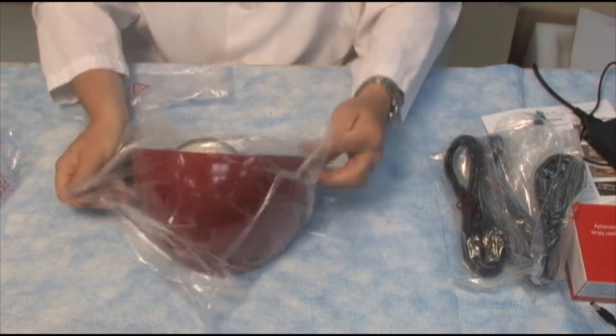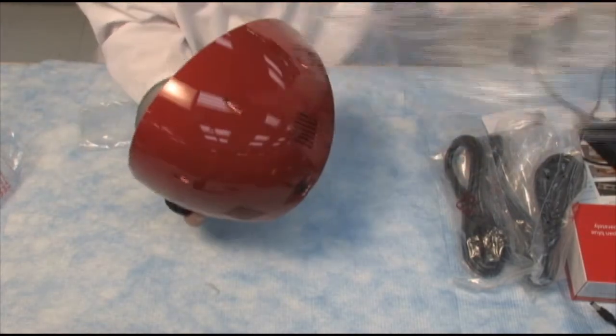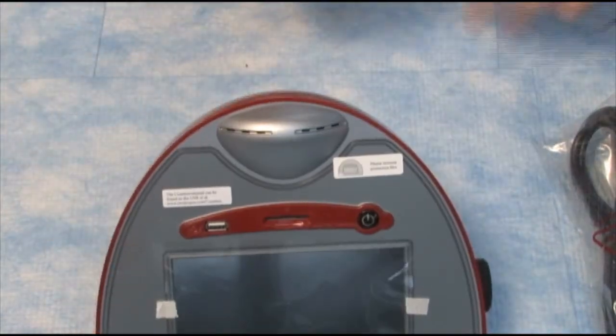So here it is, a brand spanking new Countess Automated Cell Counter. It comes pre-calibrated, so pretty much plug and play. Plug it in and let's get going.